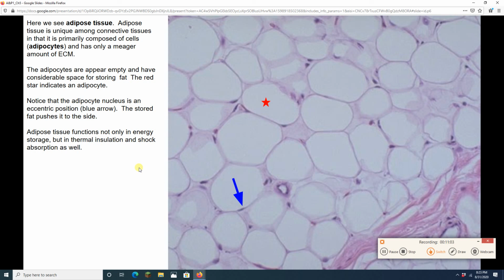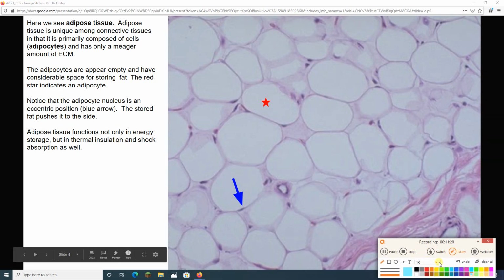All right. I want you to stare at this picture for a second with me here. Stare intently at it and look at all these sort of empty circles here. These empty circles are actually fat cells. We don't call them fat cells, we call them adipocytes. I probably should, when I underline, I shouldn't cross words out. You know what I mean?